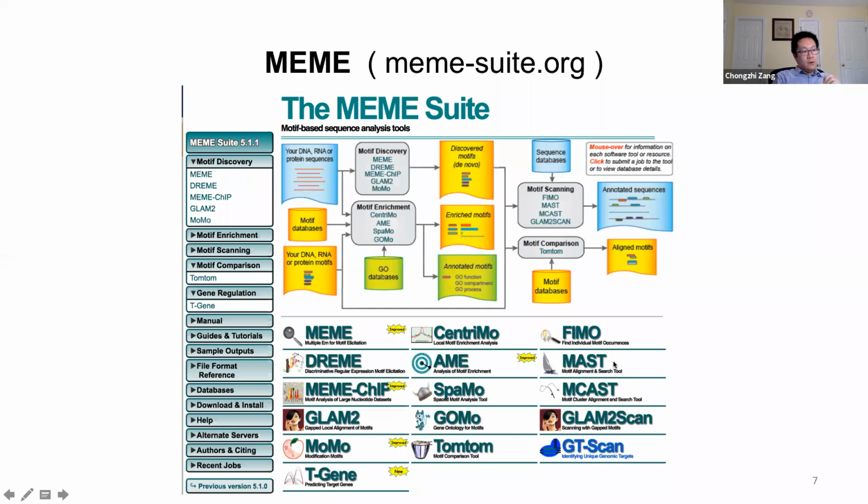Several commonly used tools for sequence motif discovery, I'll just briefly go through them. One of the most used and early developed motif discovery tools is MEME. Currently the team has developed a series of different methods with the focus of motif discovery.